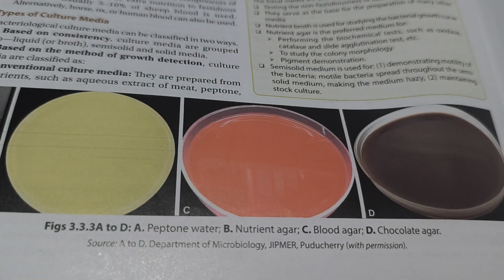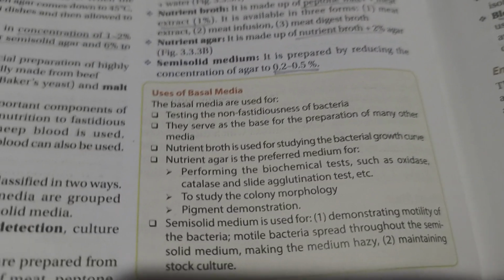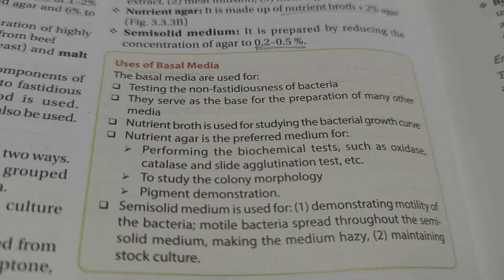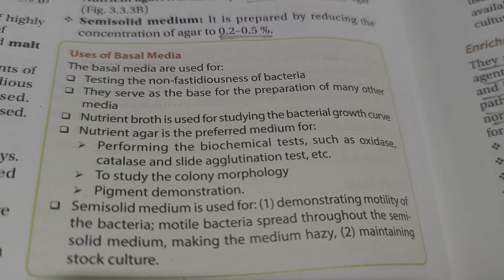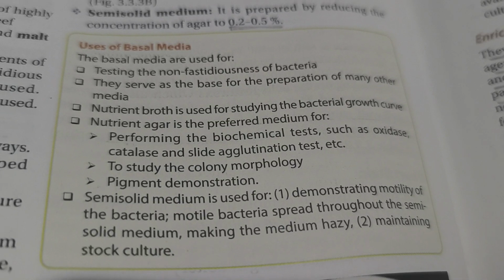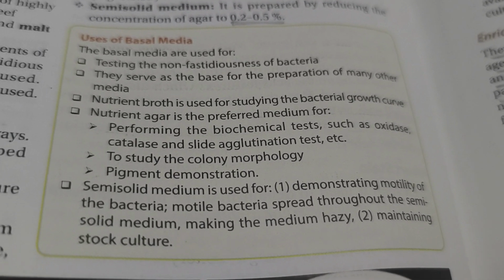Uses of basal media. The basal media are used for testing of non-fastidious bacteria. They serve as a base for preparation of many other media. Nutrient broth is used for studying bacterial growth curve.